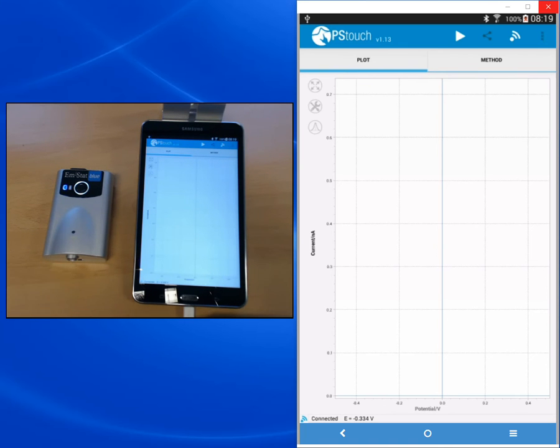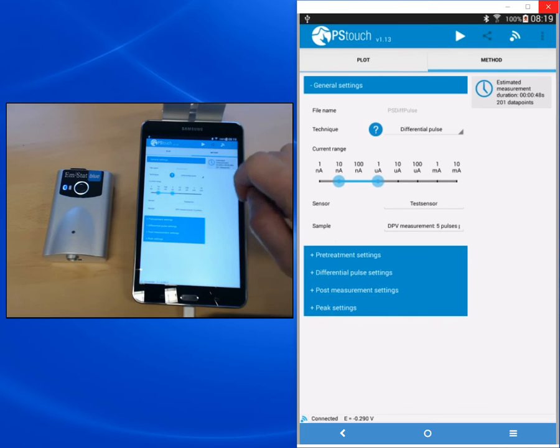Also, the LED of the EmStat Blue is now steady, indicating that a connection was created. After we've connected our device, we need to set our parameters for our measurement. Above the plot window we see two tabs, one for the plot and one for the method editor. We switch to the method editor tab where we can change the parameters. We see the file name and also a list of the techniques. Tapping on the technique name gives a drop-down list to choose the technique.